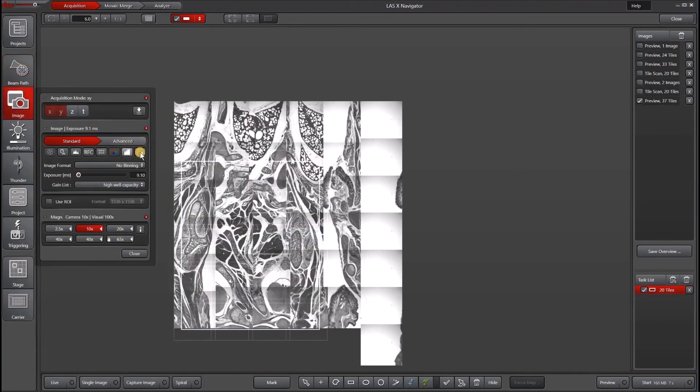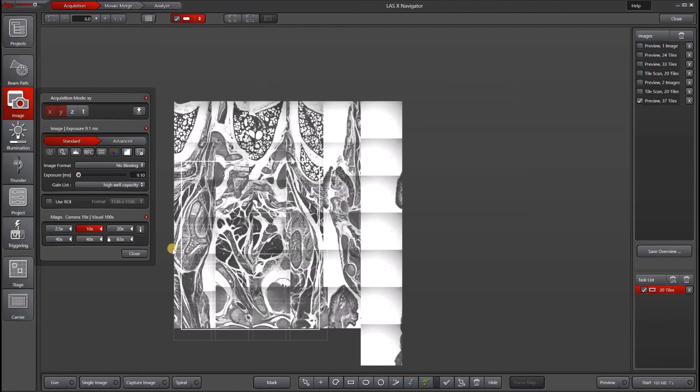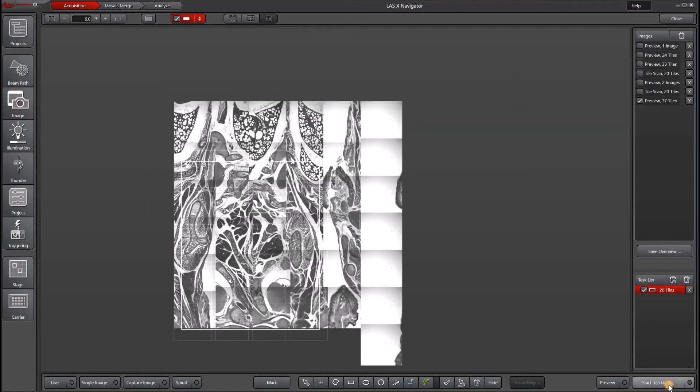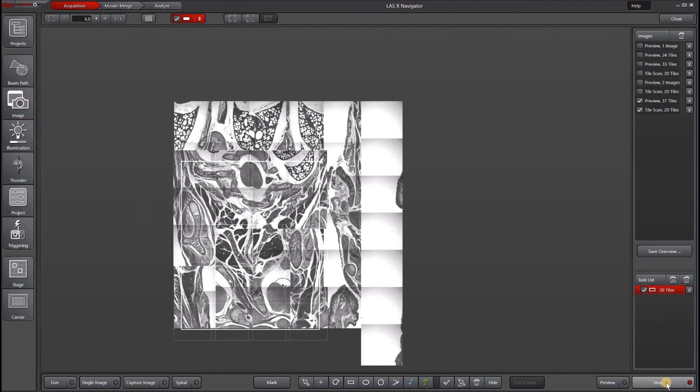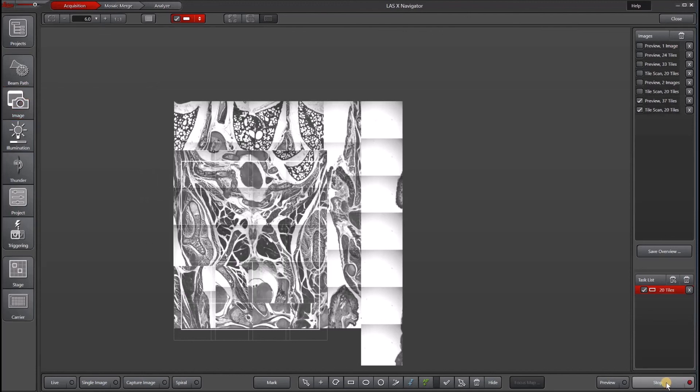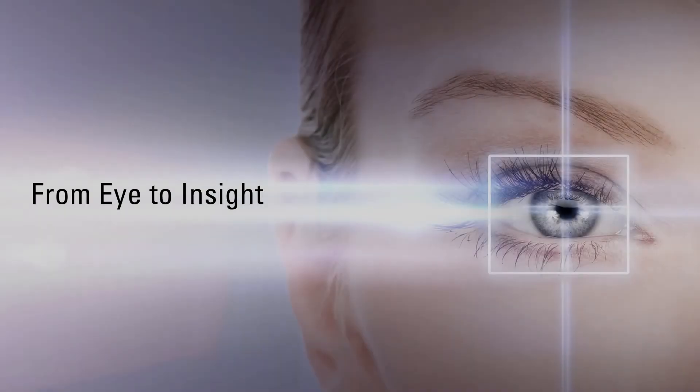So we can go into our camera preferences, which we can access either under beam path preferences or image camera preferences, either way it's the same. And then looking at our image flip, we can uncheck horizontal. Then we can hit start. And now everything is lining up just the way we need them to.